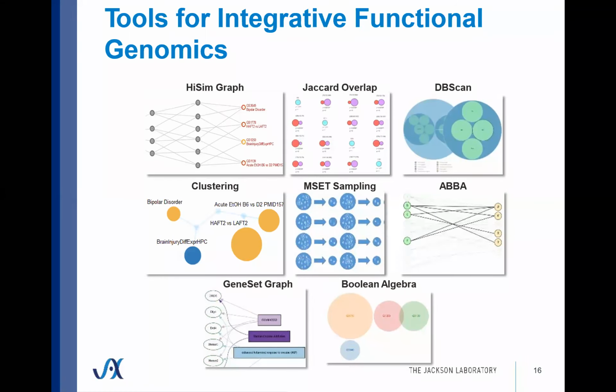In my case, I've taken from GeneNetwork, where many different tissues or many different iterations of similar gene expression analyses were run. And I just want the consensus of those. And I could choose, do I want the union of all genes for which expression in the hippocampus on any one of Rob's data sets is correlated to my behavior? So I don't have to get into the details of which set do I choose. I can take either the union or the convergence of those gene sets.